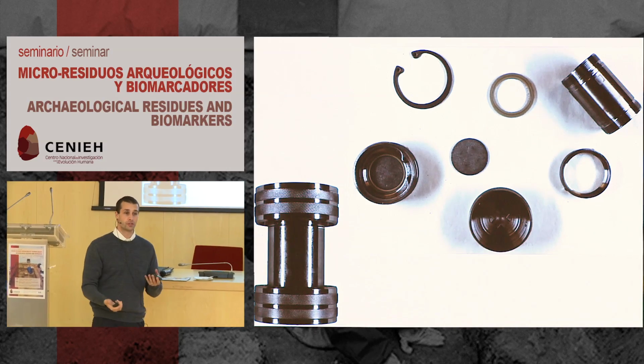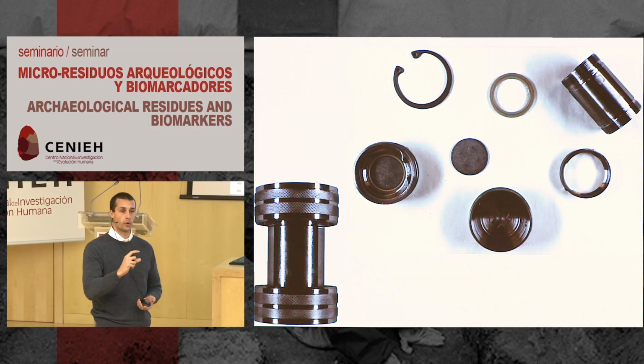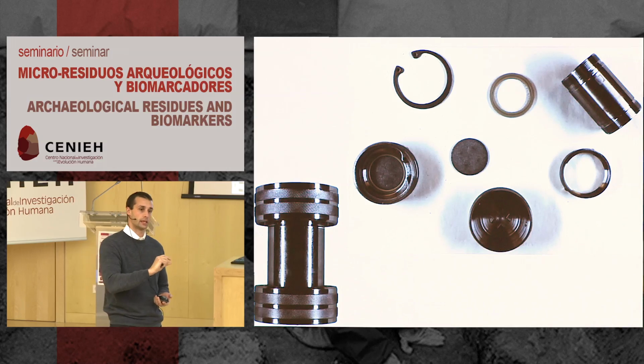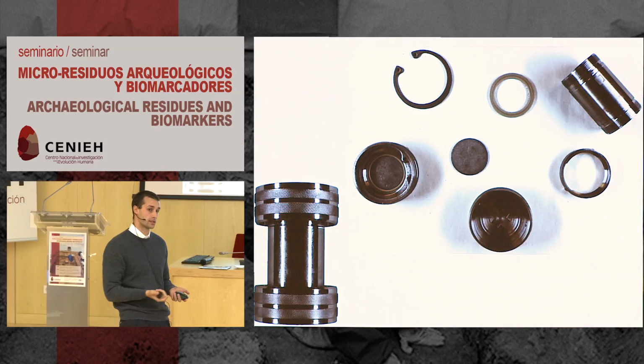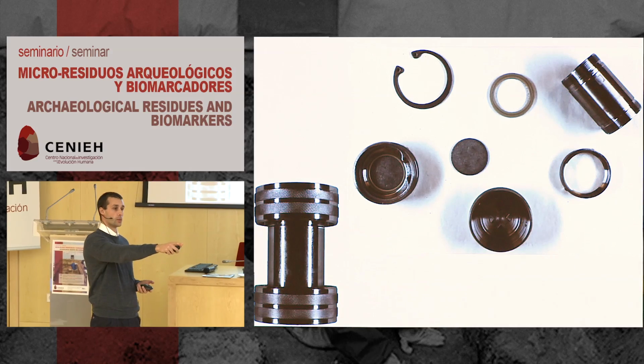Oven bake it at 500 degrees or so, and it should destroy any organics. And this acts as a buffer. You don't want to get any gases in the chamber itself, because if you get any gas leak, it really screws up the sample, and oftentimes it shuts down the machine. If that happens overnight, and no one's there to watch it.